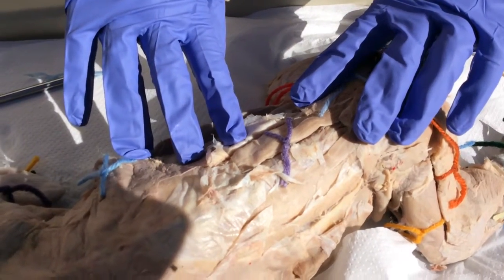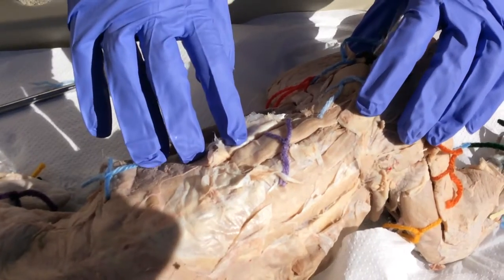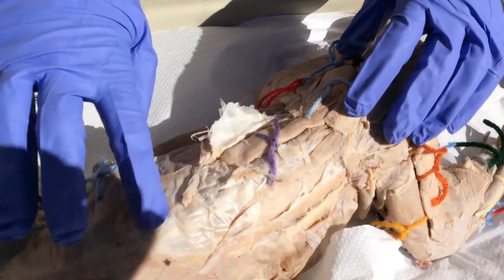Our last muscle is the erector spinae group in lavender. This erects the spine and keeps it in line. You can memorize it because it runs along both sides of the spine.